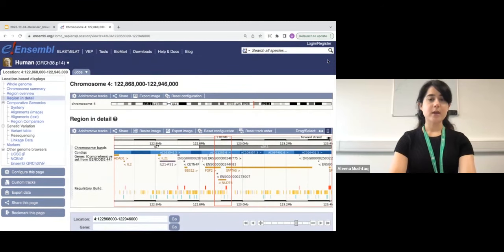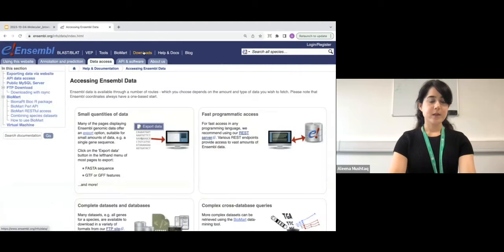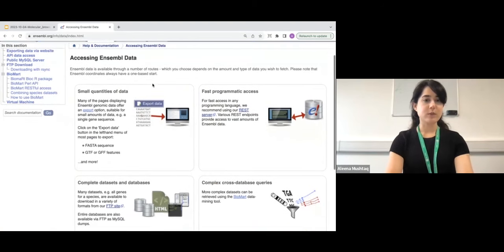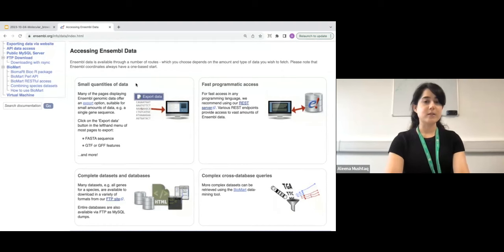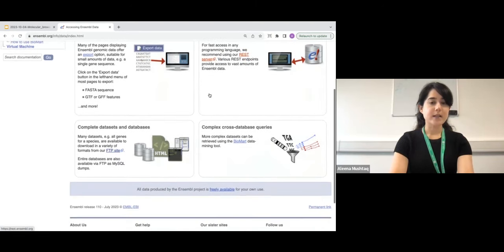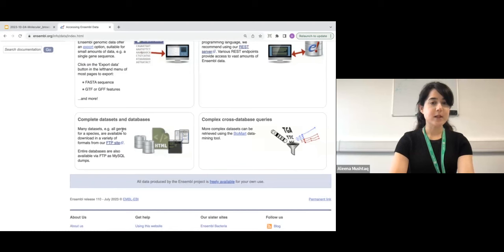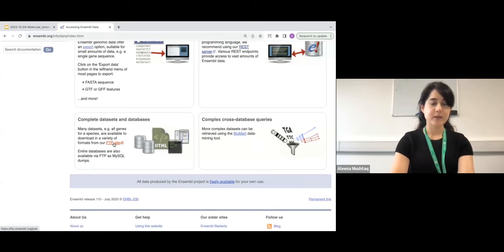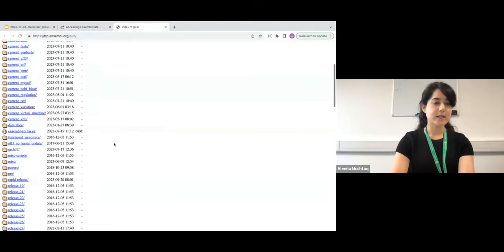The last thing I want to quickly show you is our FTP site. Clicking 'Downloads' on the navigation bar shows the different ways you can access Ensembl data — you can access small quantities by clicking export buttons on pages, there's fast programmatic access via REST API, and complete datasets and databases are available via our FTP site. The link to the FTP site is right there. Entire databases are also available via FTP as MySQL dumps. Clicking on the FTP site link, you can find all of our databases.